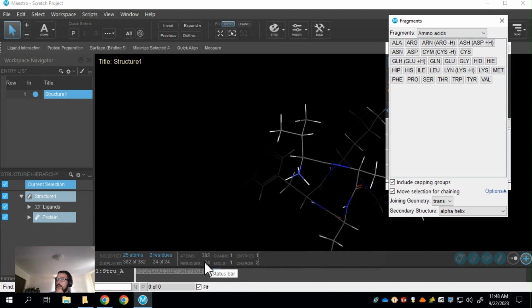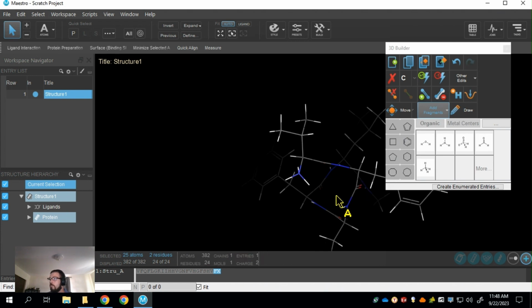Now you see that for whatever reason, it treats the cap as a new amino acid. That's also something you find when you're doing circular dichroism; it tells you, when you read about how to count your peptide bond units, to add modified termini.